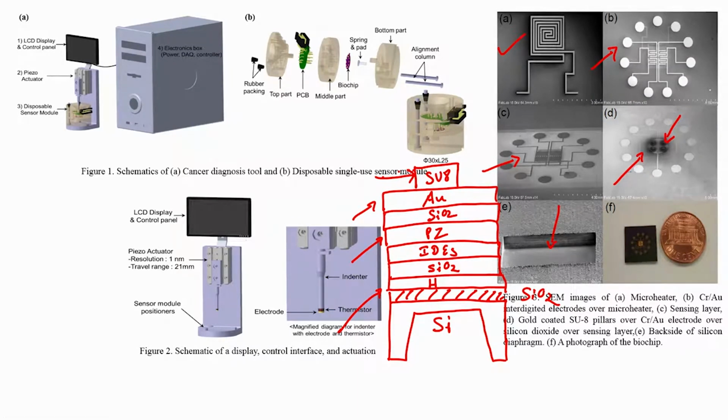Now, if I place a tissue on this chip, that means I have a tissue and this tissue is placed on this chip like this. And if I place this chip here, in between what is there? There is a tissue like this. This is my chip. Which chip? This one, or you can say this one.